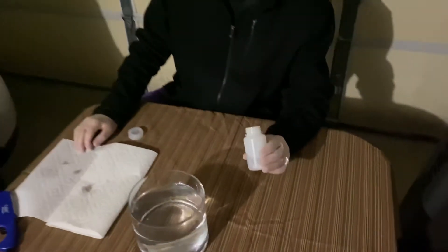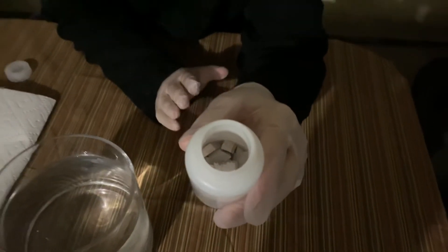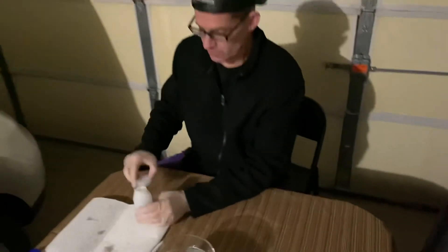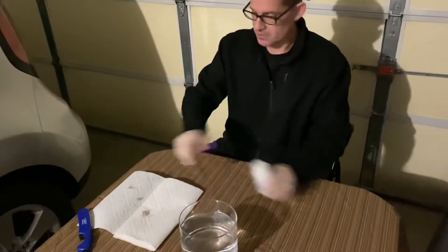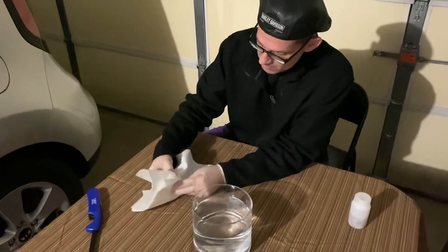I like to keep my sodium stored in mineral oil because it's so reactive to moisture in air. So the first thing I'm going to do is dab off my sodium ingot and dry off some of that mineral oil.